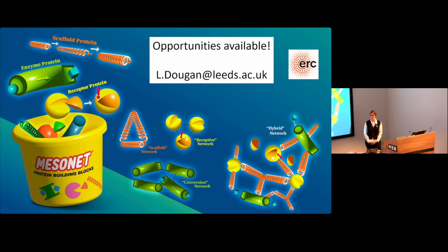So for the example that I showed today, our chemical cross-linking is irreversible, right? So the network forms. But what's really interesting is that the relaxation in the example I showed has two components. One component we think is the network rearranging, and the second component is further unfolding of the protein. Imagine you've got this building block and it's strained within this network or whatever configuration it has found itself in. That means some of these proteins will continue to unfold. I didn't show it today, but we've done a lot of biophysical characterization, so CD and FTIR, to monitor that unfolding over 12 hours, 24 hours. So this is a really dynamic system.